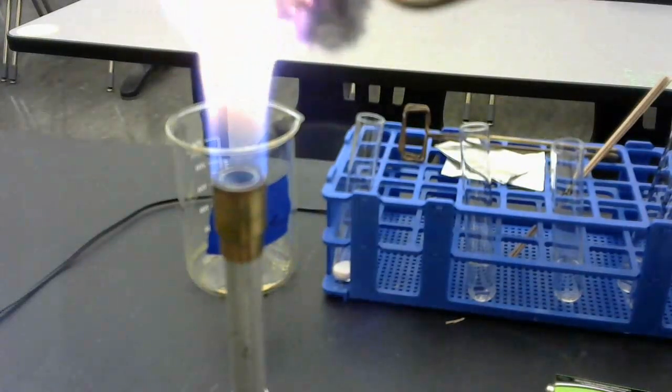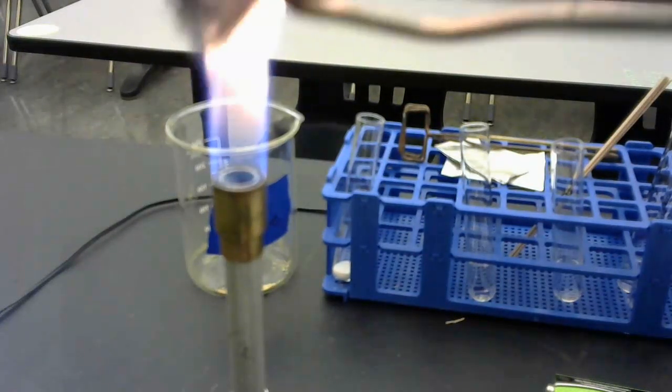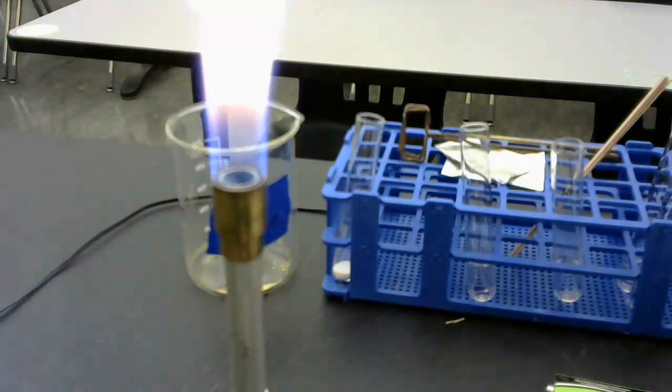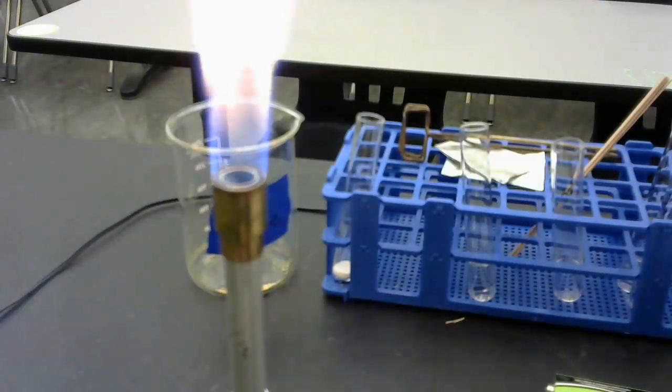This is actually a sped up reaction of what happens when something is rusting. This is the sped up process of rusting. We're rusting iron. We're turning iron into iron oxide.